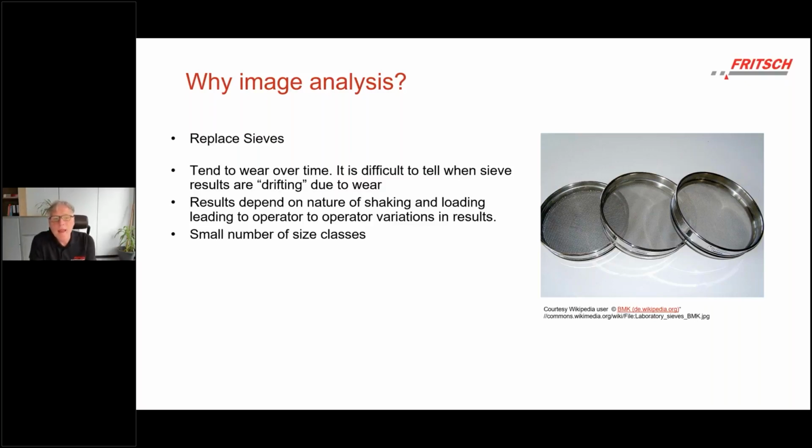And one major problem that you see again and again in reality with sieve shakers or sieves is that they wear out over time. So even using always the same sieves, you will get different results over time. And this wear out is, in my experience, mainly driven by the cleaning process.